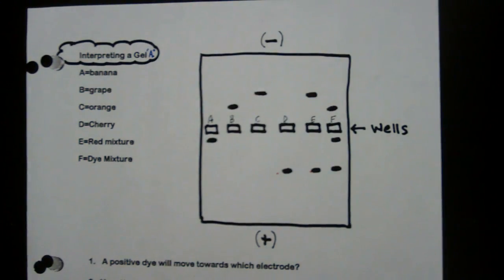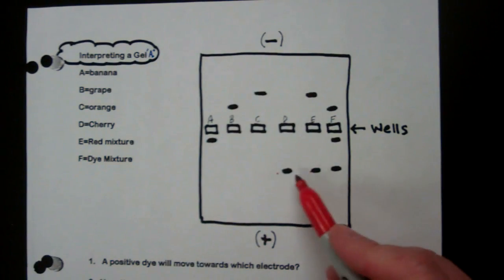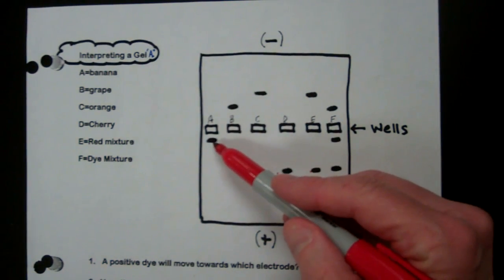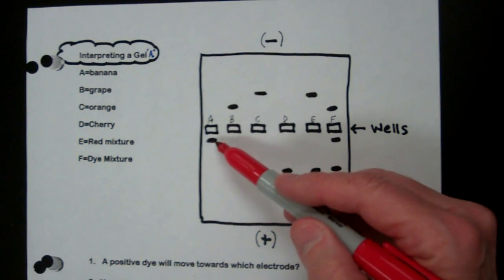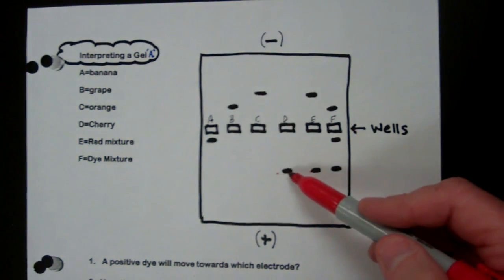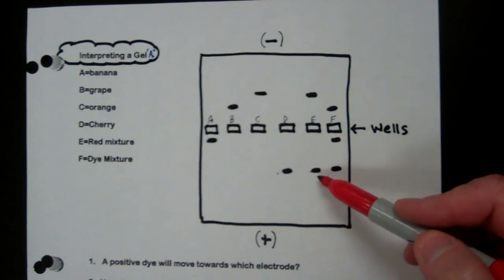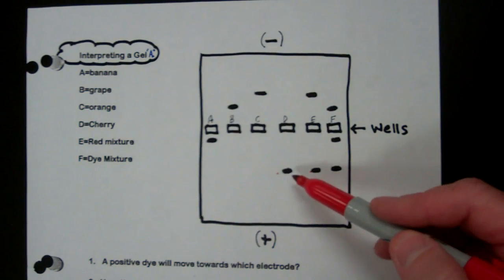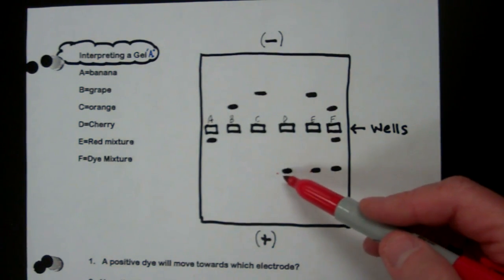So that's how you interpret a gel. These moved pretty fast. They got really far. This guy took a really long time, didn't go very far. So this is a very large molecule. These that got this far, these are the fastest. They're the smallest. They can weave through the gel very easily, so they moved fast. That means they are very small molecules.